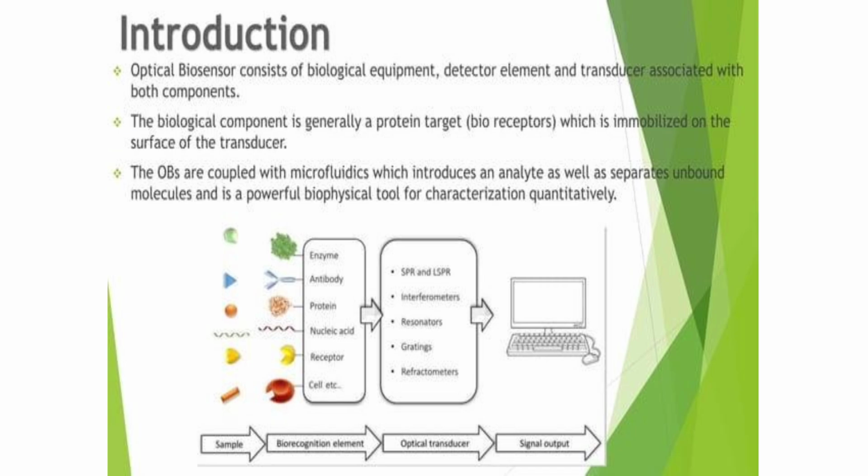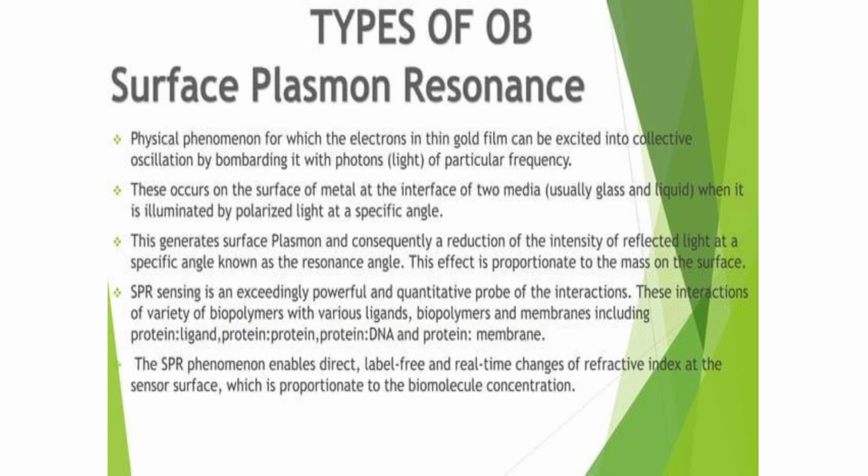These systems are frequently coupled with microfluidic networks. This microfluidic integration allows us to effectively introduce the target analyte, and it dynamically separates the background molecules from the active matrix. Here are the types of the optical biosensor.